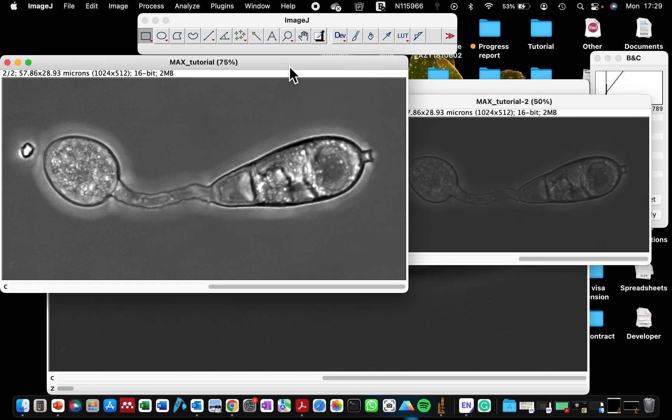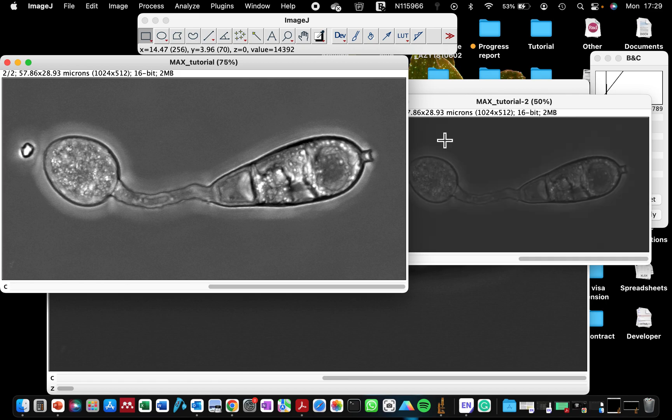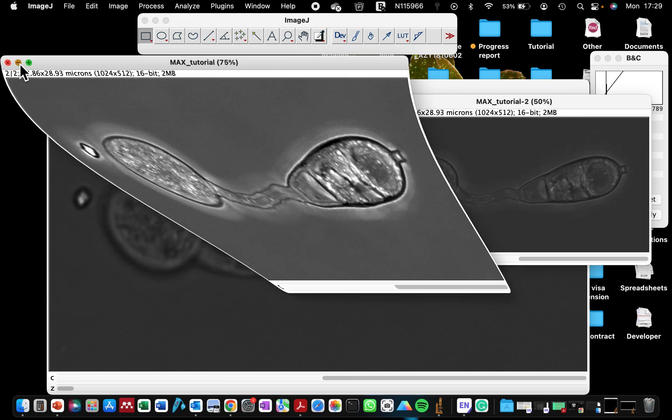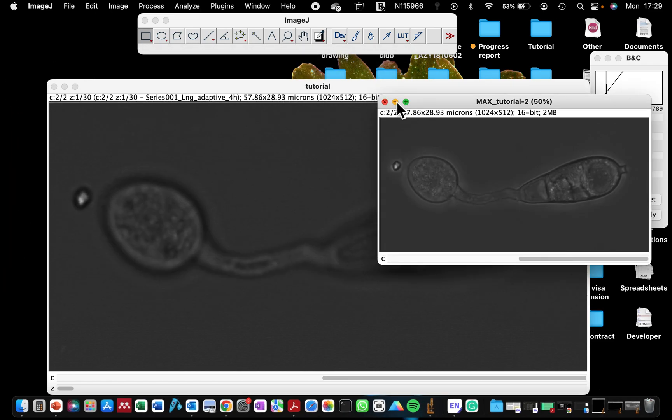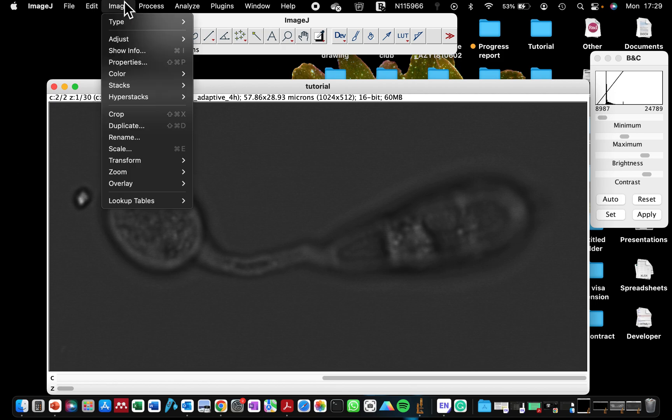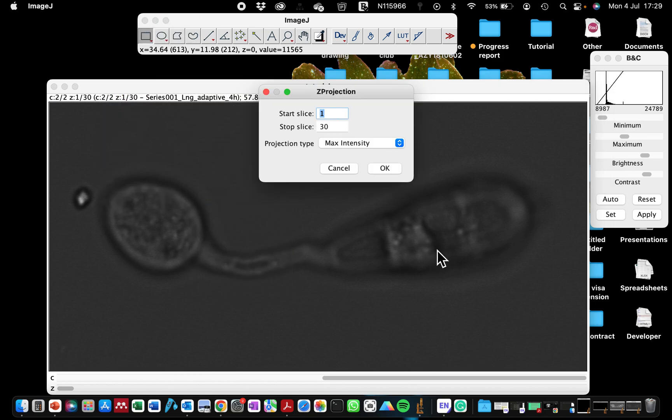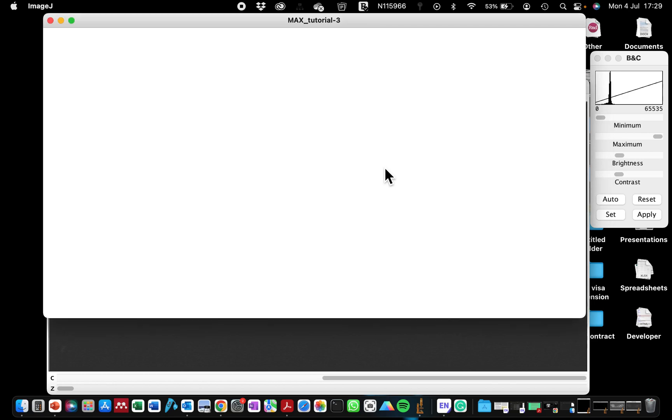So what is the other function? What is the other method that I would have used to adjust this image? I'm going to minimize this too, and then I'm just going to reprocess this stack Z projects and click on okay. So now I have this image again.